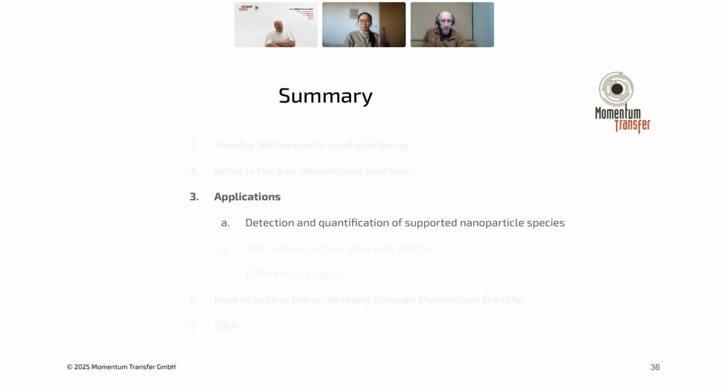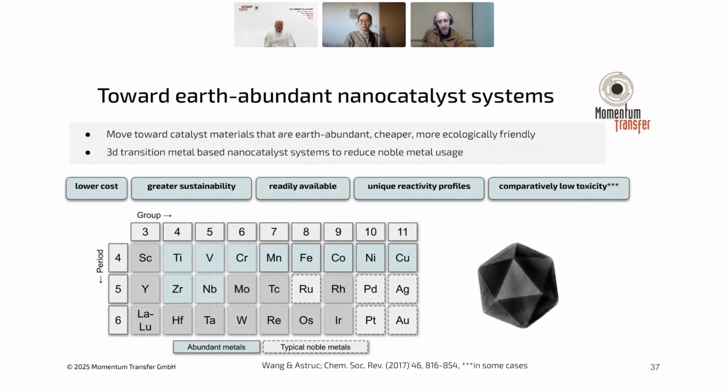So now I'll switch gears and get into a bit of the applications. The first one that I'll start with is, again, going back to this idea of detecting and quantifying what phases are present, and specifically in nanoparticle catalysts, because I think that's where the advantages of including PDF in your analysis really start to become much more apparent.